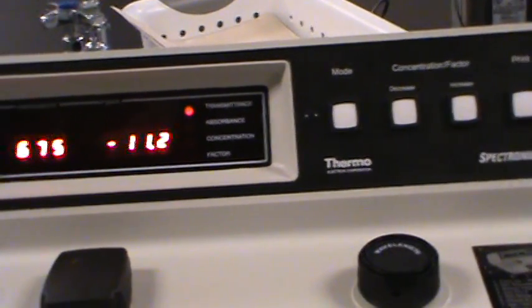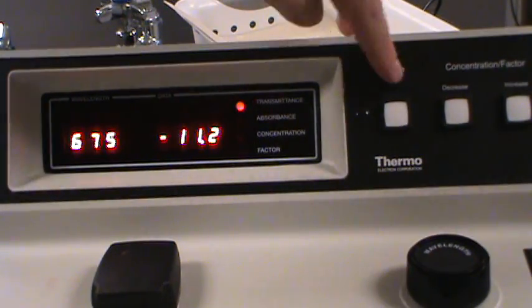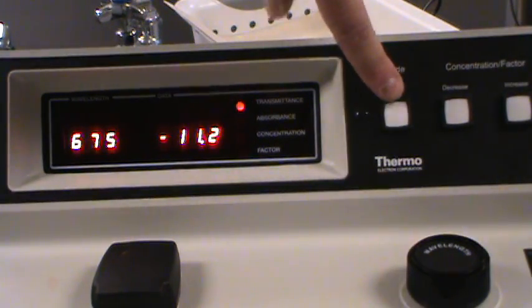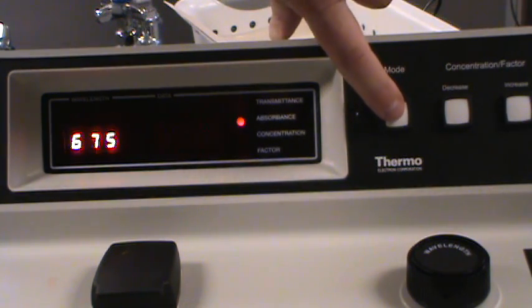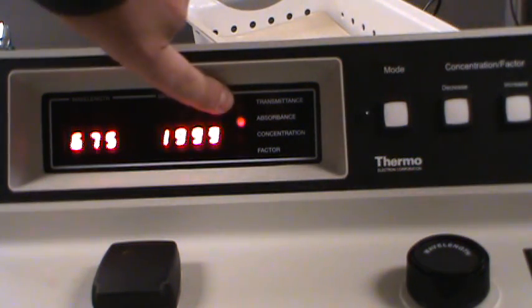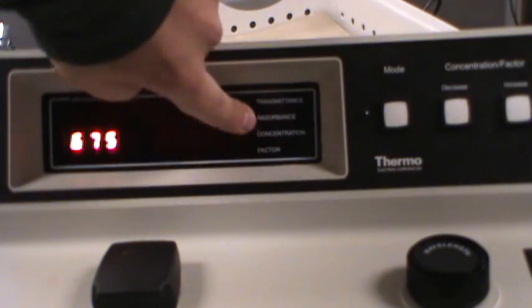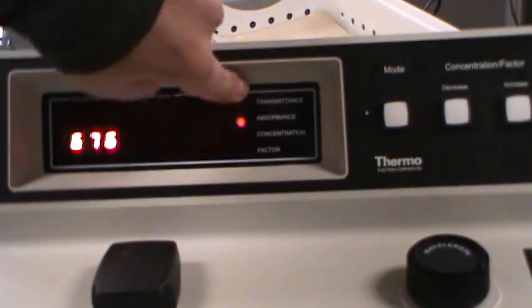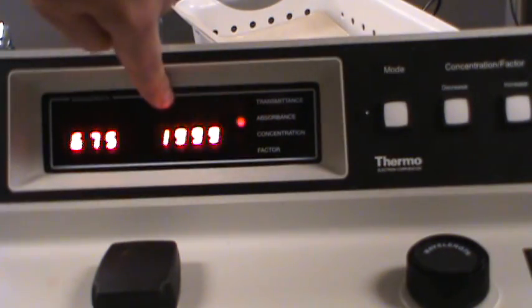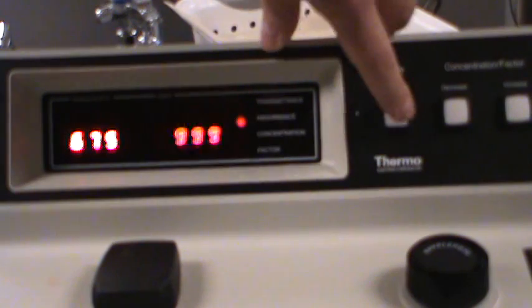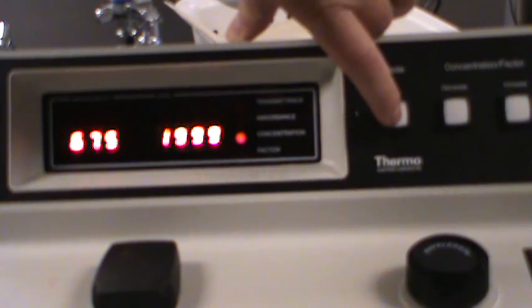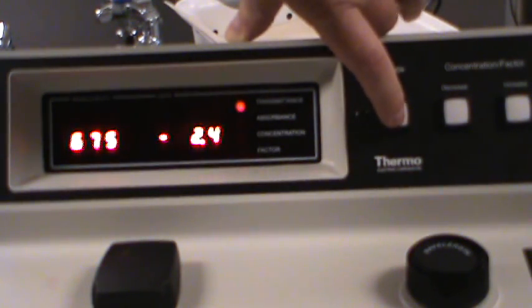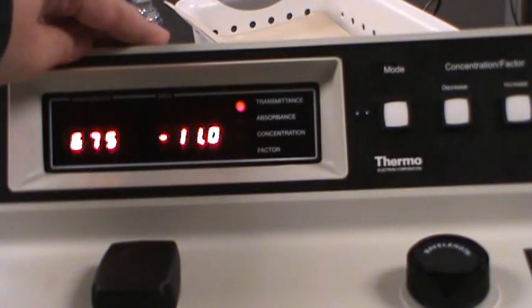What about that last button? Mode. Well let's take a look. What happens if I push mode? Oh the selector just moved down. So mode just lets us go through our four display options. So transmittance, absorbance, concentration, factor, and right back to transmittance. So that's a little tour of the instrument.